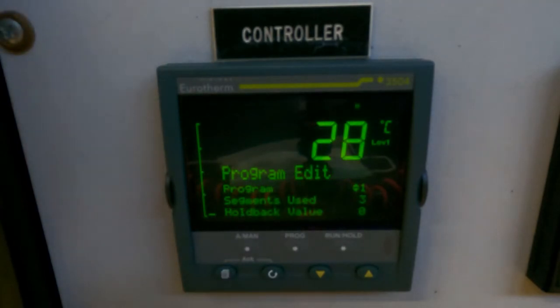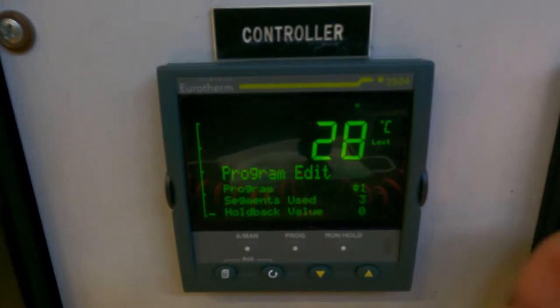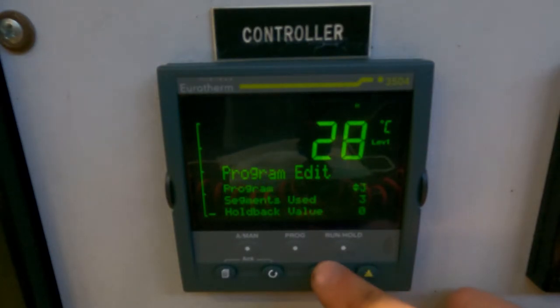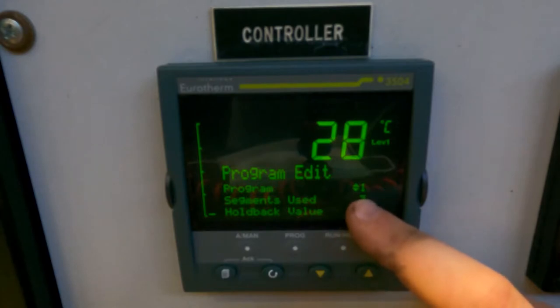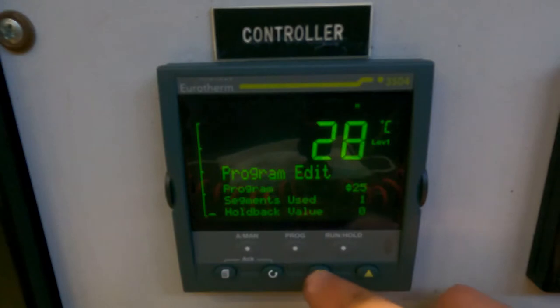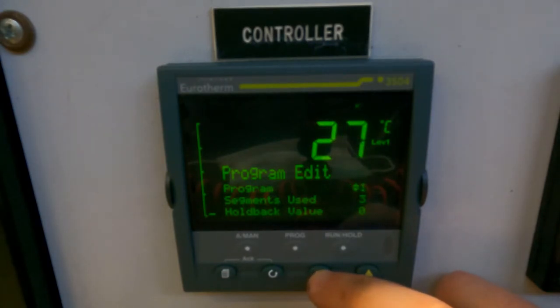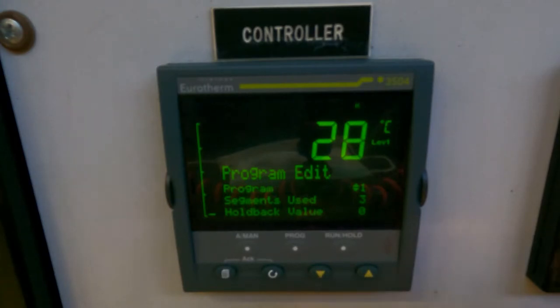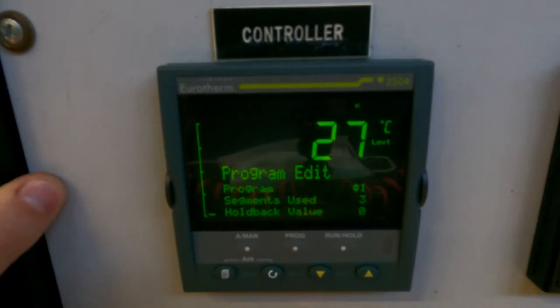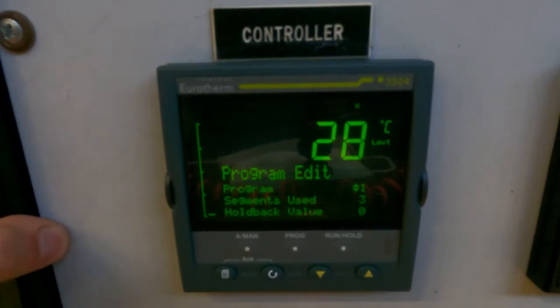If we go over to program edit, this is where we can start to build our program. You pick which program number you want. Some of these are already written so you can just edit them. I'm going to make program one our example here. I believe it goes up to 25 — so there are 25 separate programs you can write. If you're afraid of overwriting somebody's important programs, make sure you check first, but in general they're pretty easy to write unless you have a really long one. For today I'm just going to go over how to write in these programs and run them. If you need more details about other settings like the alarm settings, I suggest reading the manual.